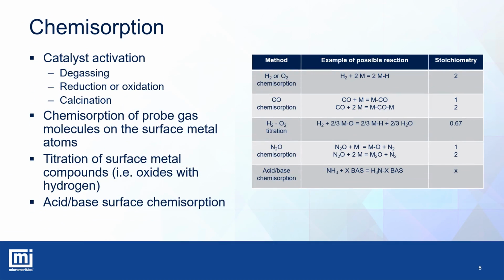The chemisorption techniques are very well established analytical methods to evaluate the free metal-specific surface area and metal dispersion degree. These methods consist in performing a real chemical reaction in isothermal conditions between a reactive gas and a catalyst that has been previously activated in a suitable way. The pretreatment procedure should be designed according to the required analysis. We can identify three main chemisorption procedures.